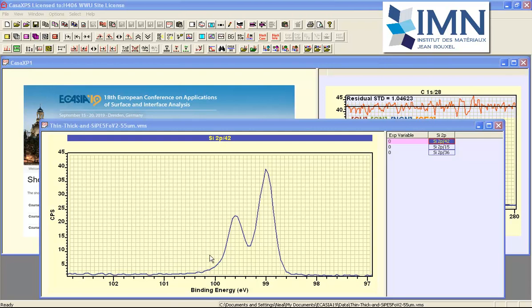It's also clear from the silicon 2p 1/2 peak that there is some form of asymmetry evident in this particular peak, and we anticipate that the 3/2 peak will have a similar sort of asymmetry. So what we would like to do is construct a pair of peaks that will return the correct ratio and fit the data in the sense of a figure of merit, such as a chi-square or an RMS.